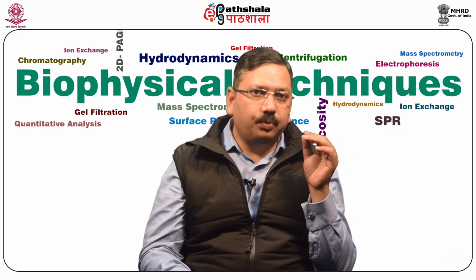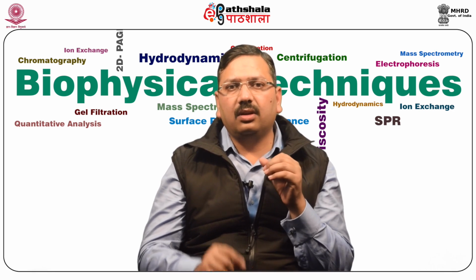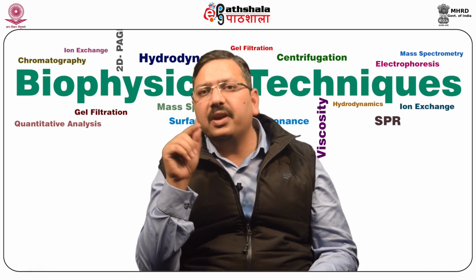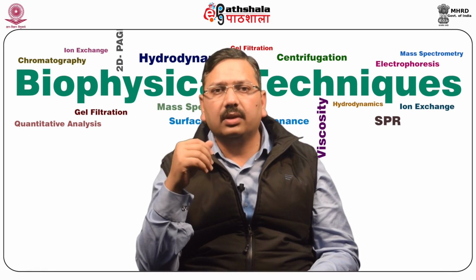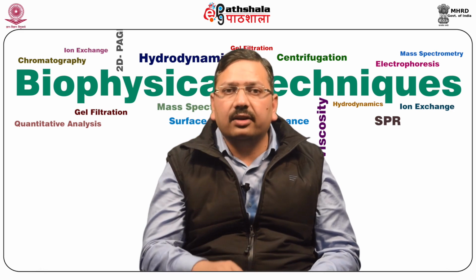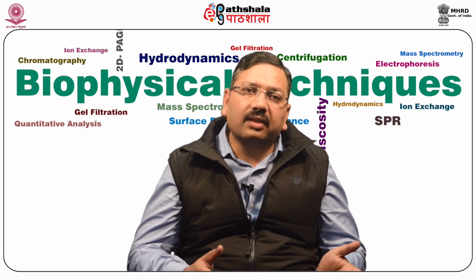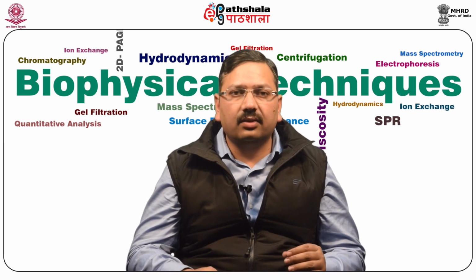Okay, broadly these techniques involve several points. Number one, creating gas phase ions from the analyte molecules. Then second one is separating ions according to their mass to charge ratio, that is m by z, and lastly measuring the abundances of these ions.